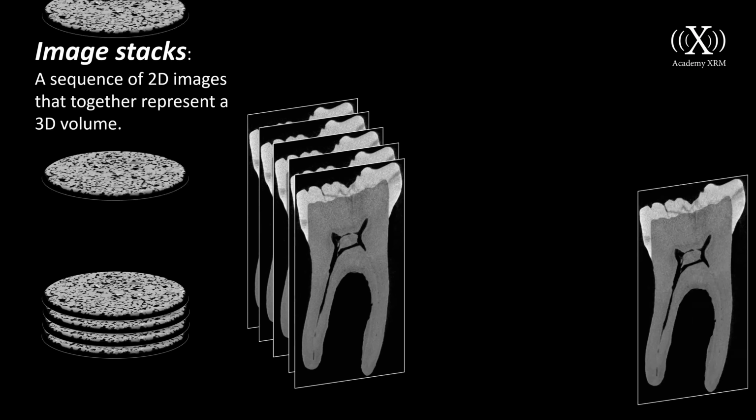If you see three numbers, the data is loaded as a vector volume. This means each voxel contains multiple values, and some tools may not work correctly. So we need to convert it to a scalar volume, where each voxel has a single intensity value. From the module drop-down menu, I'll go to Converters and select Vector to Scalar Volume module. Make sure the input volume is selected correctly, then create a new output volume. I'll name it molar_scalar.